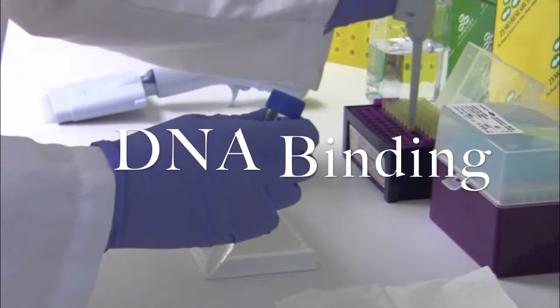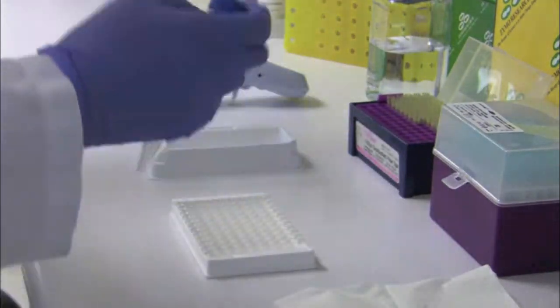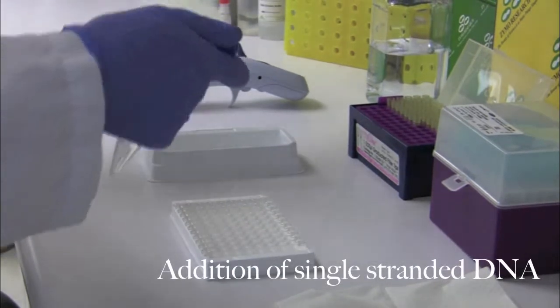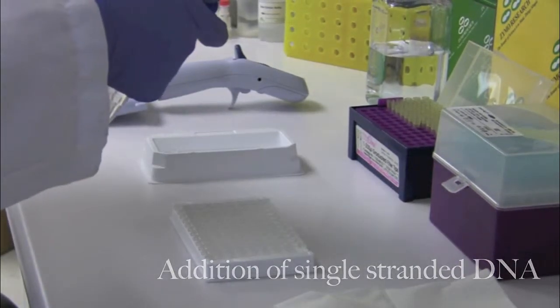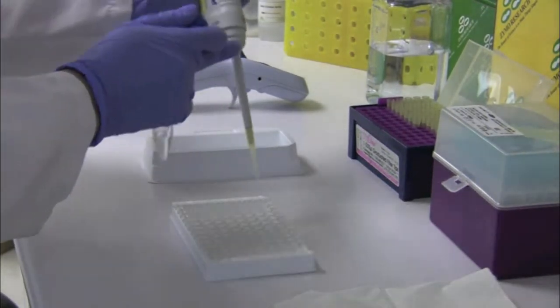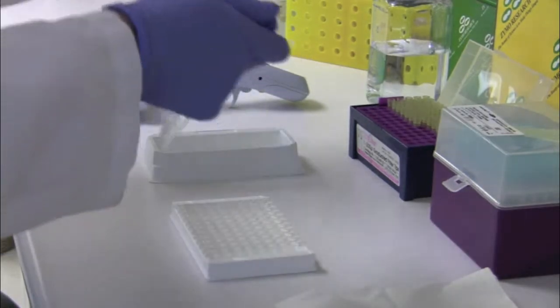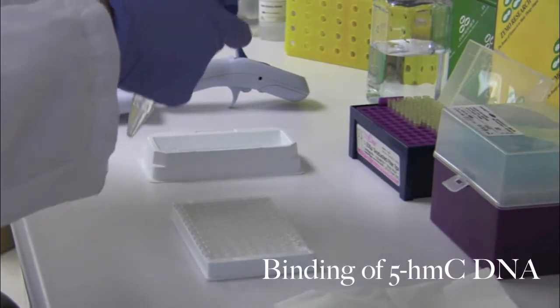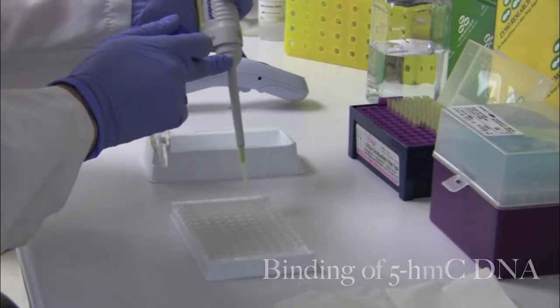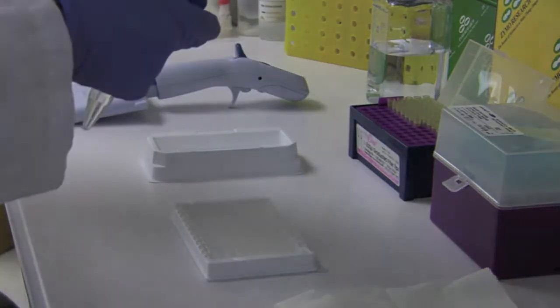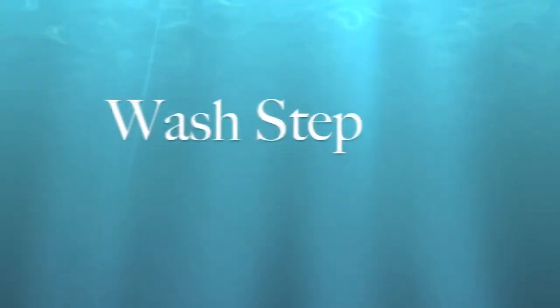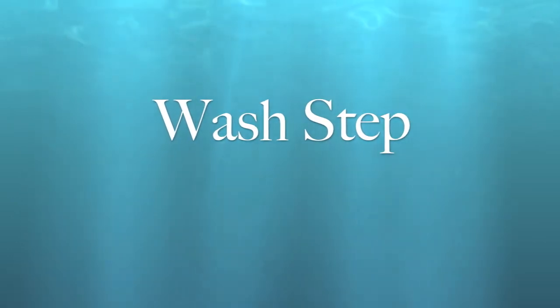The blocking buffer is then discarded and single-stranded DNA controls and samples are incubated in the wells for one hour at 37 degrees Celsius. DNA that contains 5-HMC will bind to the anti-5-HMC polyclonal antibody coated to the wells. Any DNA that does not contain 5-HMC will be washed away during a repeated wash step.